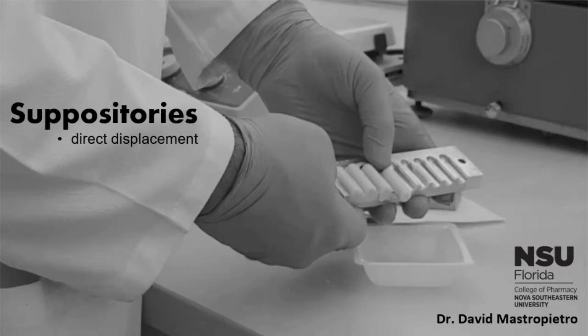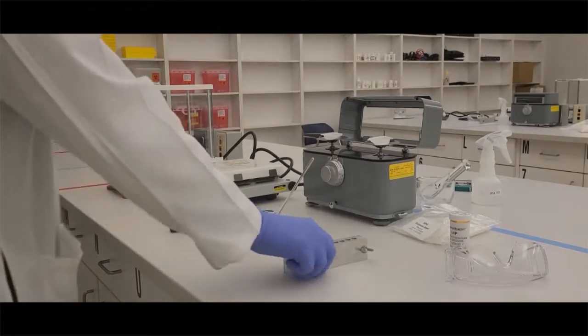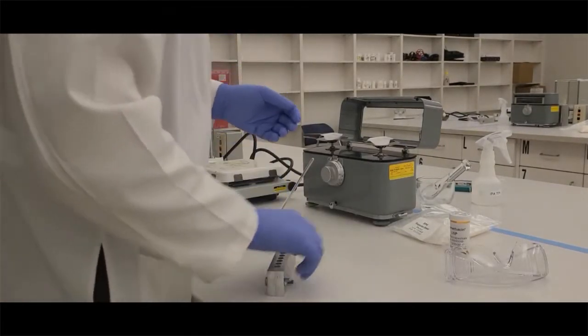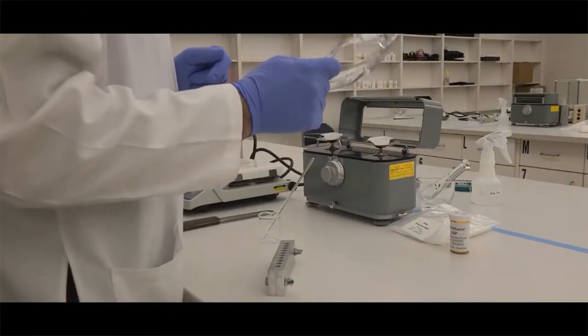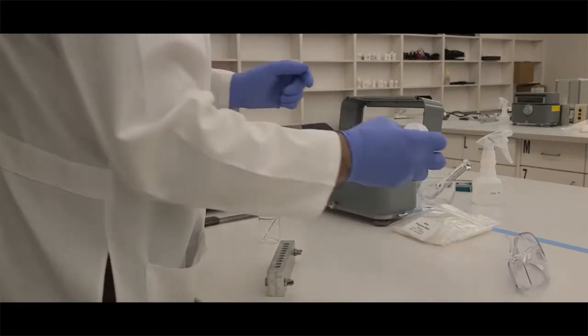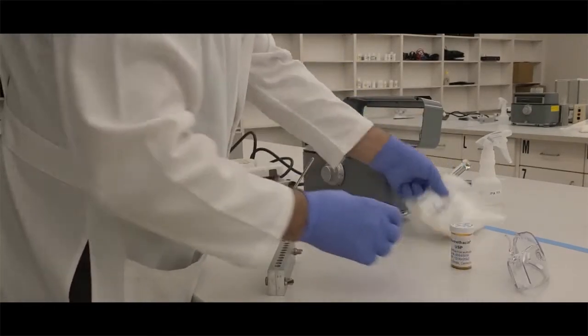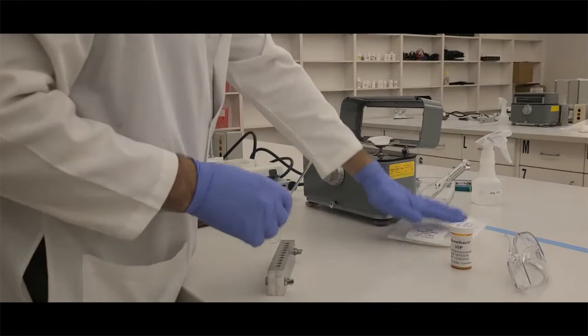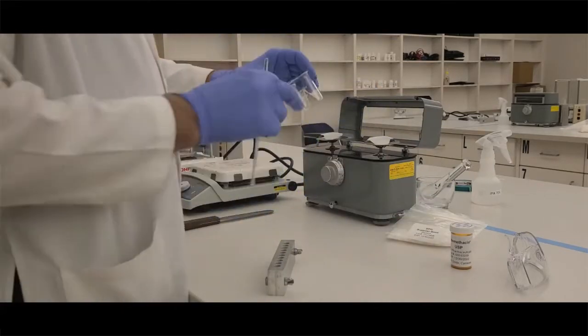This video is for suppositories using the direct displacement method. For this lab, we need a suppository mold—in this case, an aluminum mold. We'll need safety glasses because there's splash potential. We need our drug, indomethacin, and our suppository base, a fatty SPG base.